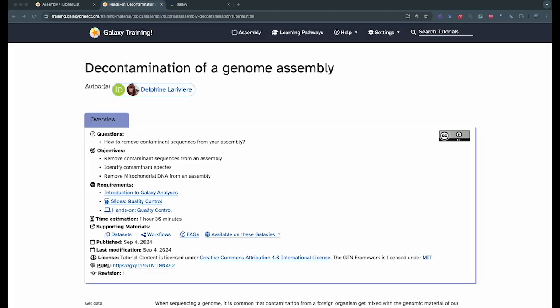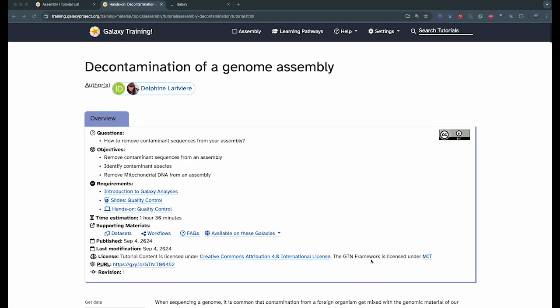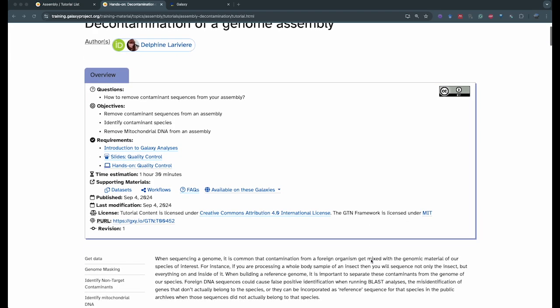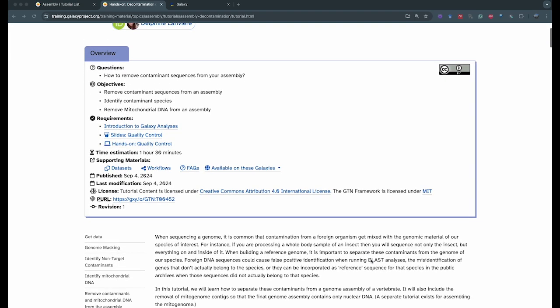Thank you for joining today for this video. Today we're going to talk about the decontamination of a genome assembly. So when you sequence a genome, it's common that you have contamination from foreign organisms that get mixed with the genomic material of our species of interest.